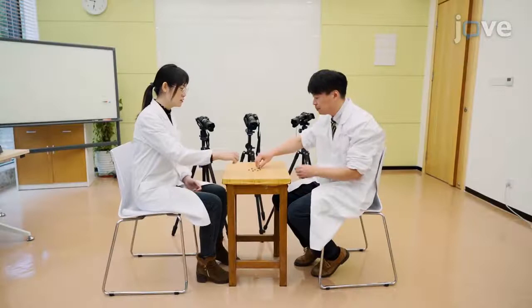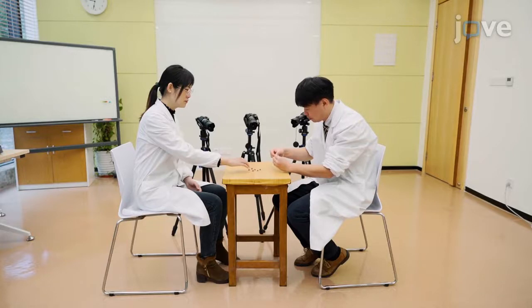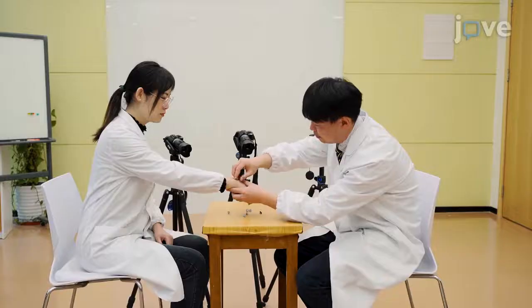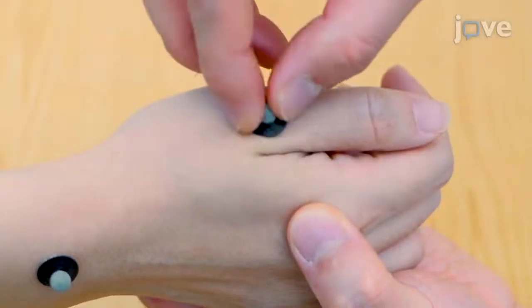To begin, take seven reflective balls with a diameter of 6.5 mm for attachment on the participant's holding needle hand. Attach one ball on the midpoint of the ulna and radial styloid, defined as tracking point: wrist joint. Attach one ball at the metacarpophalangeal joint, defined as tracking point: thumb base joint.